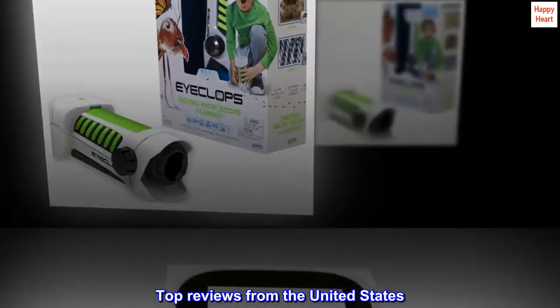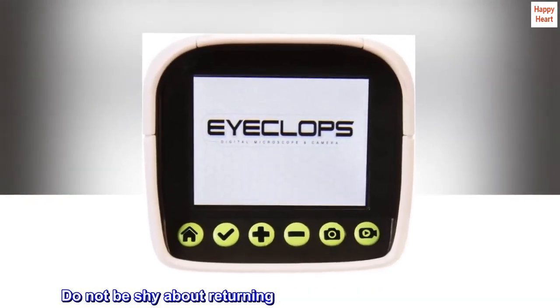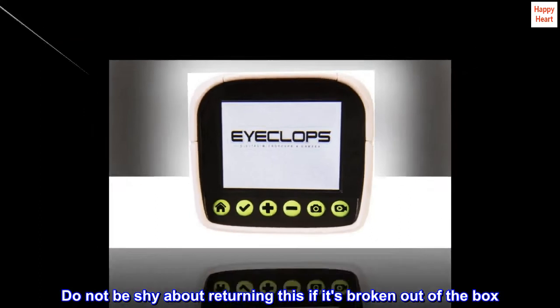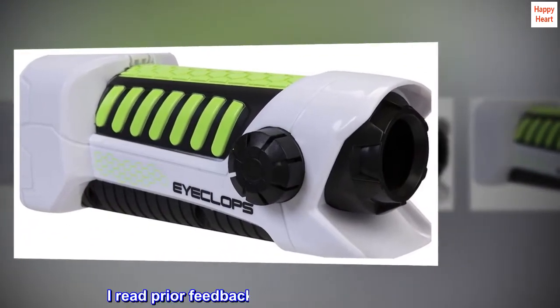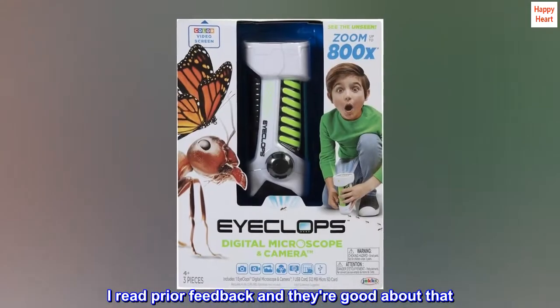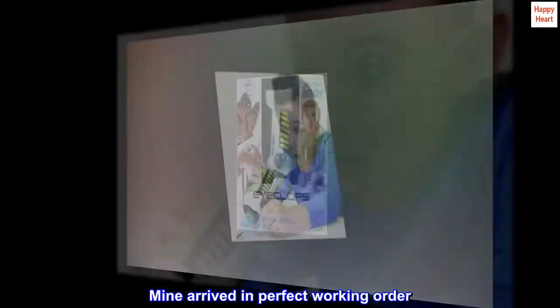Top reviews from the United States. Do not be shy about returning this if it's broken out of the box — I read prior feedback and they're good about that. Mine arrived in perfect working order.